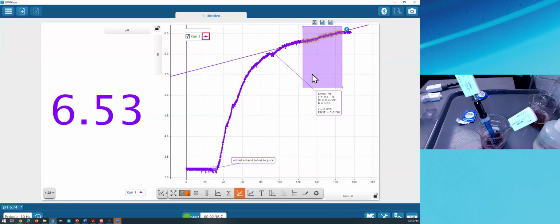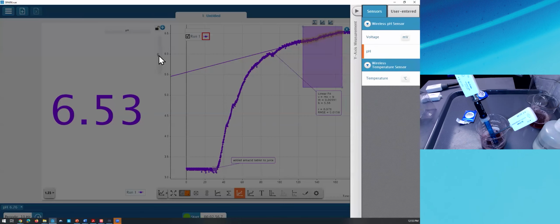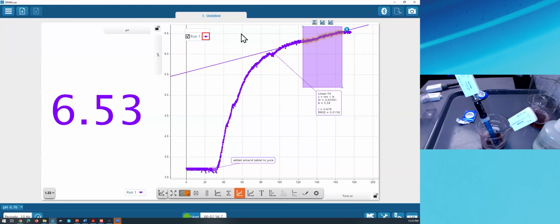Now, you'll recall that many of you had questions about temperature. Was this endothermic or exothermic? And even though I didn't show the temperature when I chose to set up this experiment for the sake of simplicity, we can look at temperature as well. I could simply go over to the y-axis of my graph, click on it, and change that to, say, the temperature measurement. If I did that, though, I'm going to lose my analysis. So I'm going to just remain here in this graph.